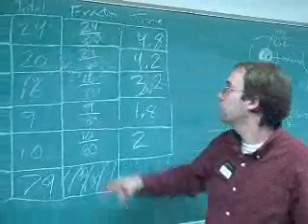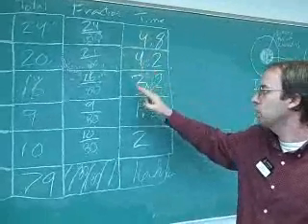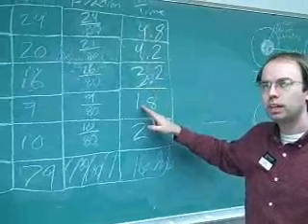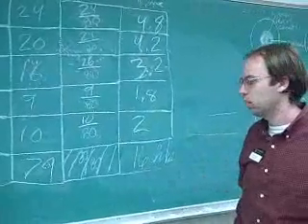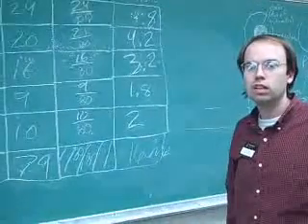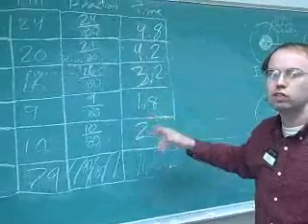And so we found an estimate of about 4.8 hours in interphase, 4.2 in prophase, 3.2 hours in metaphase, 1.8 hours in anaphase, 2 hours in telophase. So it sums up to be 16 hours like it should. And this is roughly correct. The longest phase of the cell cycle is interphase, and the shortest is anaphase, at least for allium.